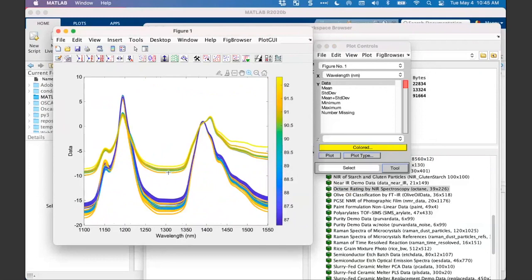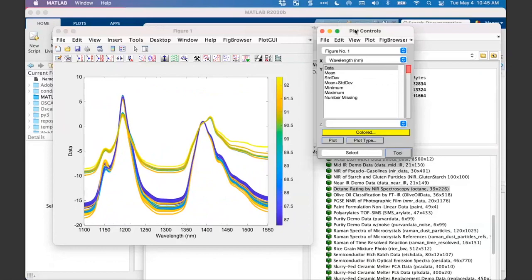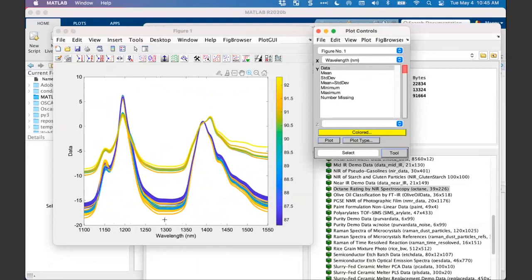Those are some of the tools that are available, and sometimes we don't know that they're there, but they are super useful when you're trying to find out if your preprocessing is doing what you need. When you're doing any kind of regression, what you want to look for are areas where you see a smooth change in your color by map.